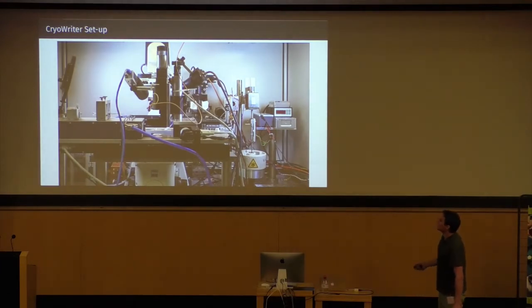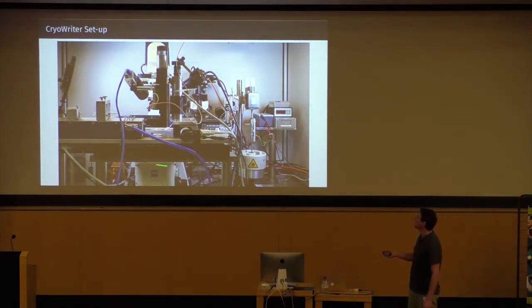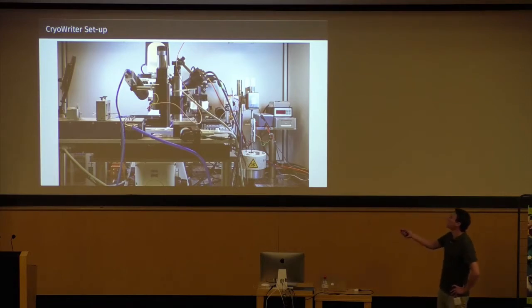This is actually how the setup looks in real life. So it consists of many high precision linear stages. We have a high precision pump in there, which gives us sub-nanoliter precision to manipulate the sample. This syringe is connected to the capillary, which is now somewhere here. Then we have many cameras to monitor what is going on. Here is the inverted fluorescent microscope with the cell incubator on top. Back here in the back you can see the electromagnetic trap.